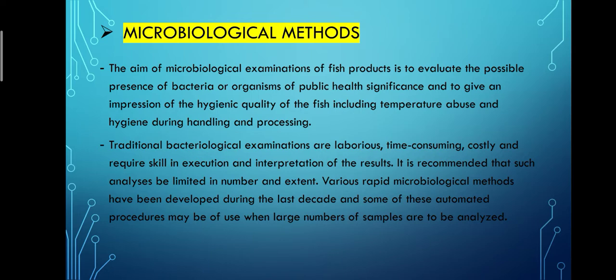The aim of microbiological examinations of fish product is to evaluate the possible presence of bacteria or organisms of public health significance and to give an impression of the hygienic quality of the fish, including temperature abuse and hygiene during handling and processing. Traditional bacteriological examinations are laborious, time-consuming, costly, and require skill in execution and interpretation of the results. It is recommended that such analysis can be limited in number and extent.